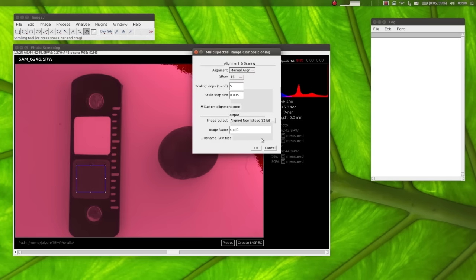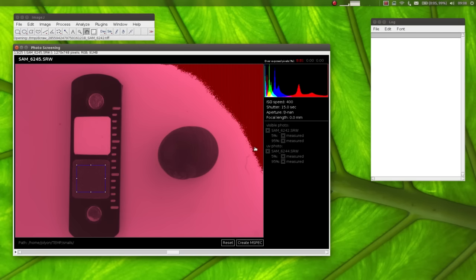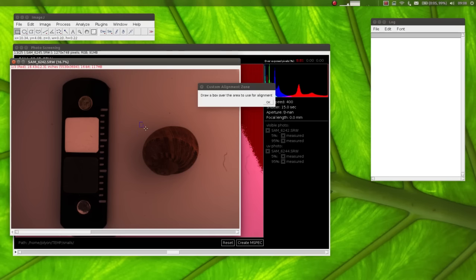Right, now let's create multispectral image. Again, I'll just choose manual alignment and select a custom zone. This time, just as an example, I'll show you what the pseudo UV output looks like. This is a false color image output that is non-linear. So it's a nice way of previewing your image in color to make sure it's aligned and looks okay. And this is snail 2. You just want to align the snail.